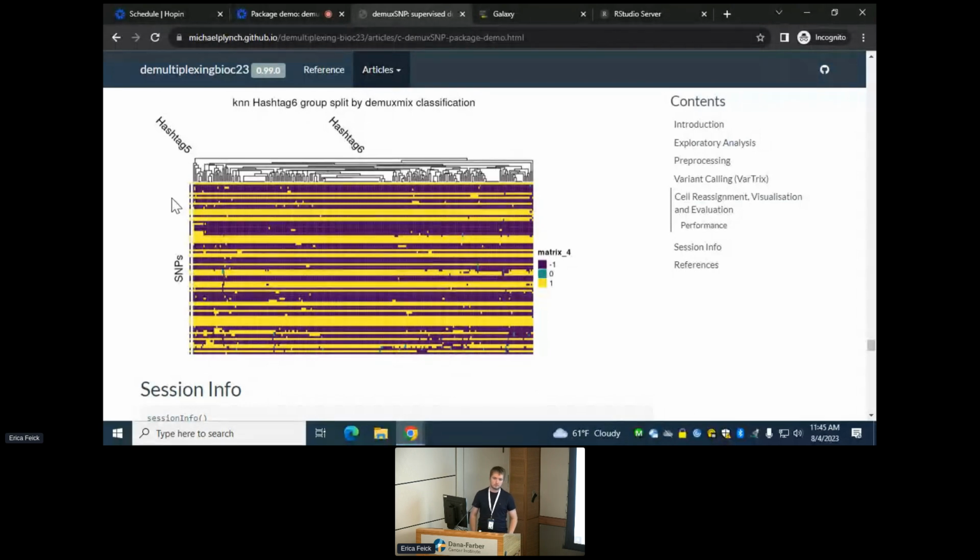So I suppose it depends on the distribution of those somatic mutations. I think you definitely could probe the data a little bit better using this, but again, it would come back to how many SNPs you had. If it's just two samples, it'd be a little bit easier. As you increase the number of samples, you need more SNPs to separate the data, but it would be an interesting application.